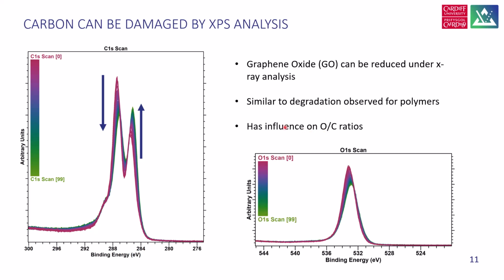And again, we can see that this change is concomitant again. The changes in the carbon we can relate back to the changes in the oxygen 1s spectra. And this is an important thing. Although we will be looking hands-on with only the carbon spectra in this case, you have to take XPS spectra as a whole. And indeed, the carbon changes in the carbon 1s should be reflected by changes in the oxygen as well, if these two elements are linked, which typically in carbonaceous materials they are.